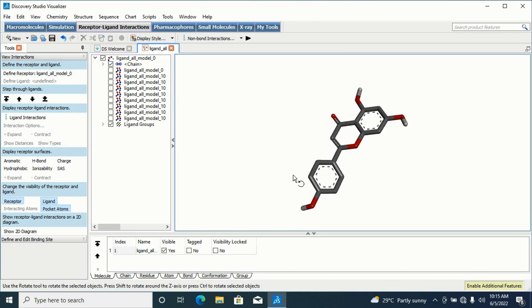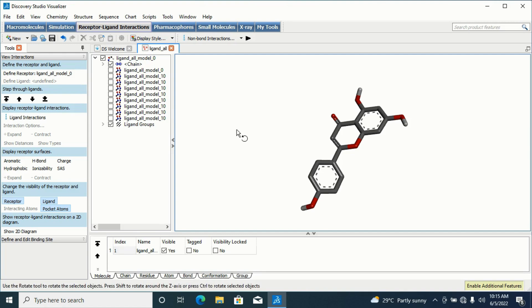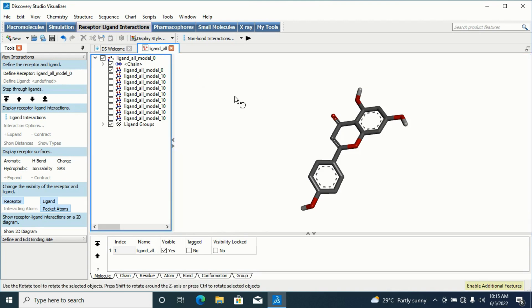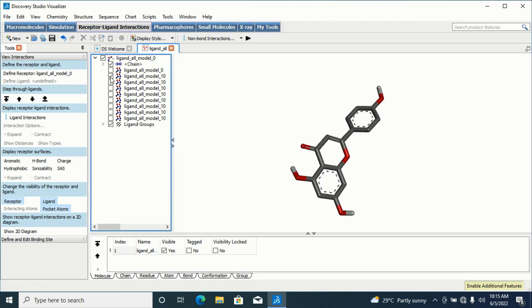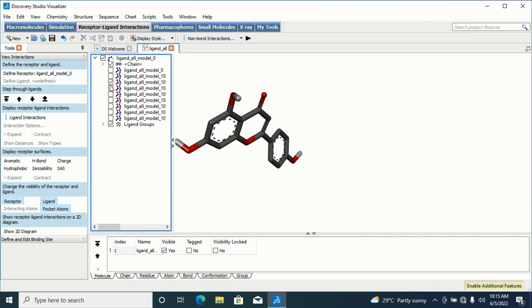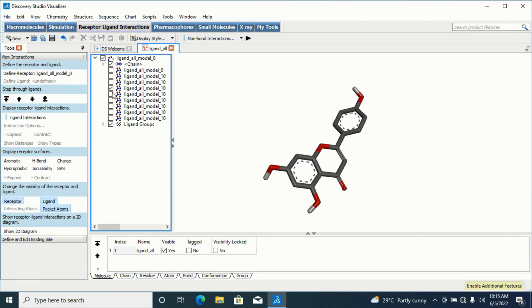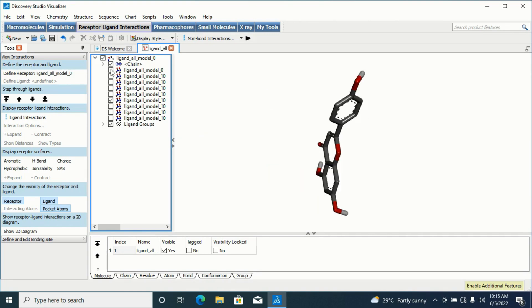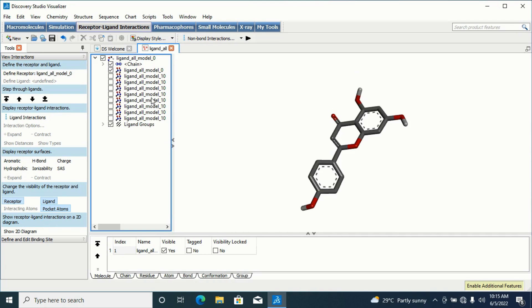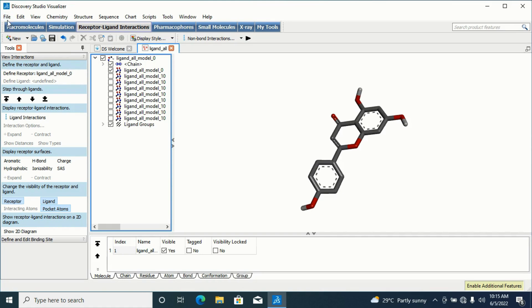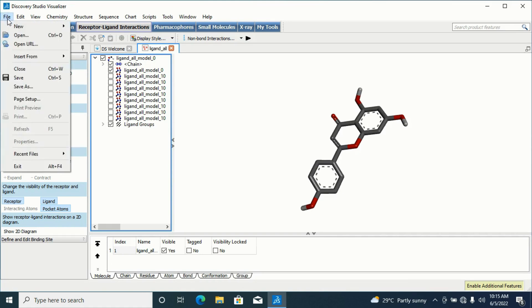These are the different conformations with different binding energies. They are all in PDBQT format, so what I'll do first is convert them to PDB format before inserting them into my protein and visualizing the interaction. This is the first conformation, this is the second one, this is the third one — as you keep clicking it keeps changing to the different conformations.